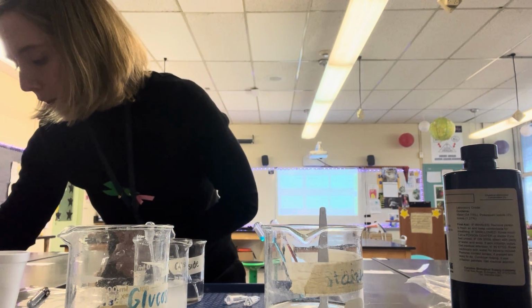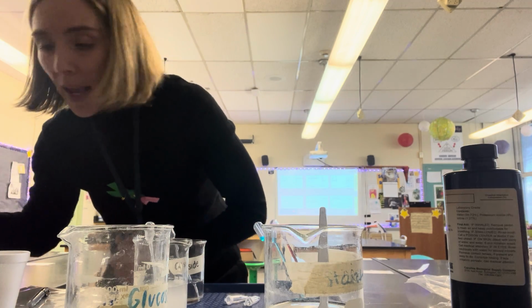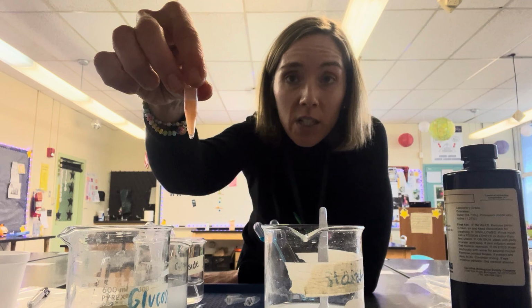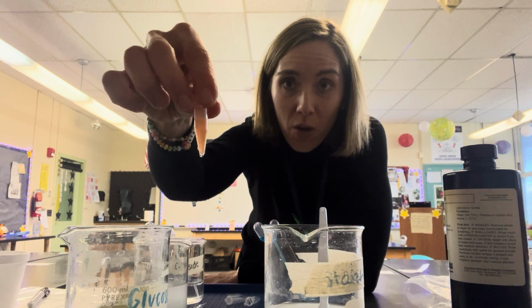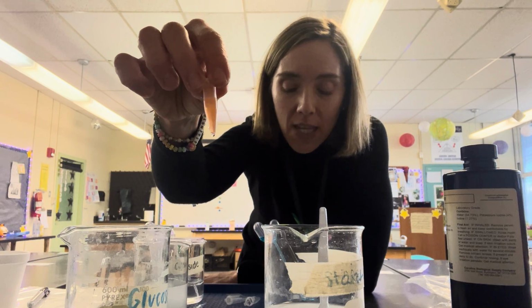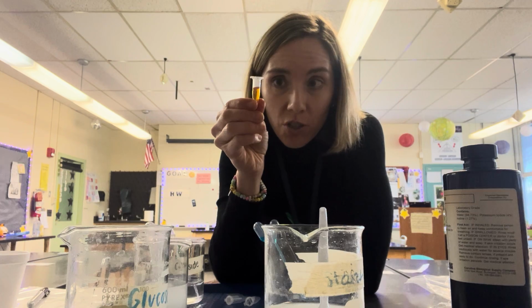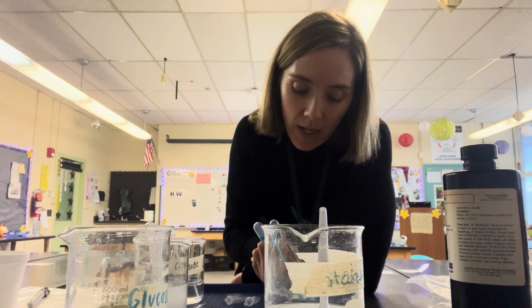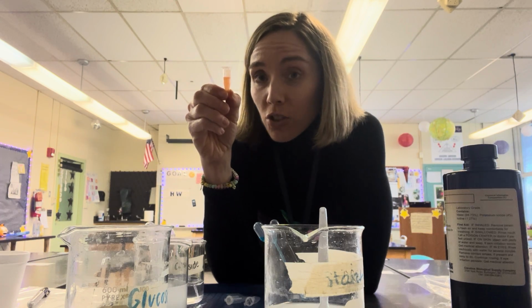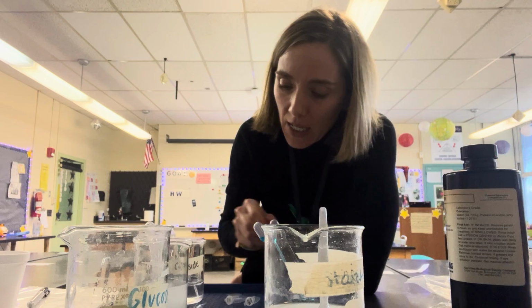Ooh, okay. So now I have over here with my hot water, my outside Benedict's, and look, it changed to this orange color, telling me that there is glucose outside of the tube. The Benedict's solution reacted to it being outside. All right, so what we see is outside, no starch, iodine did not react. Outside, Benedict's turned orange, tells us that there is glucose outside of the tube. Let's see what happened for the inside liquid.